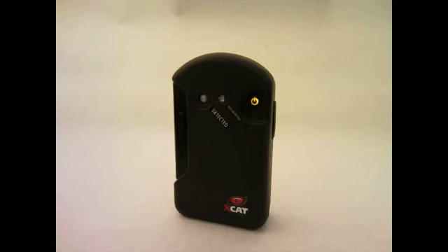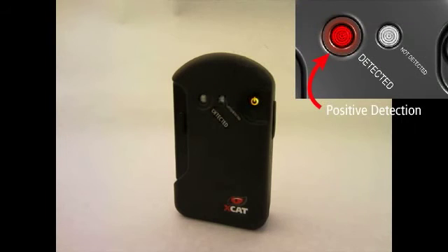The not detected light will flash yellow while the unit is processing. A red light will identify positive detection confirming existence of suspected substance. Or a green light will identify a negative result that the suspected substance was not detected.